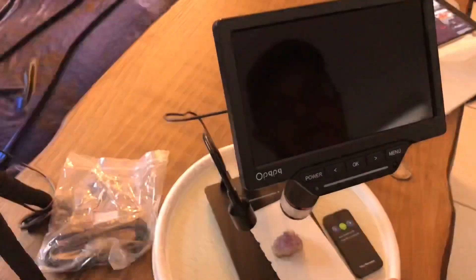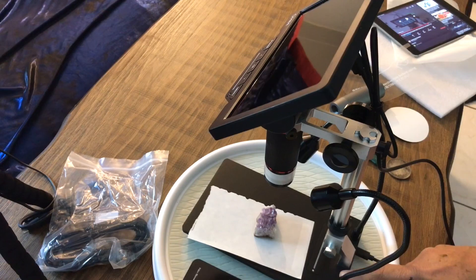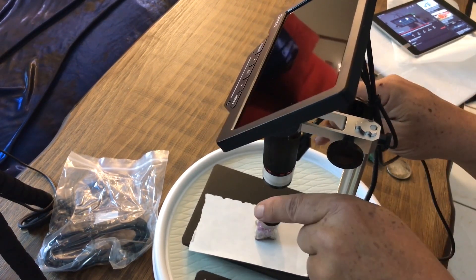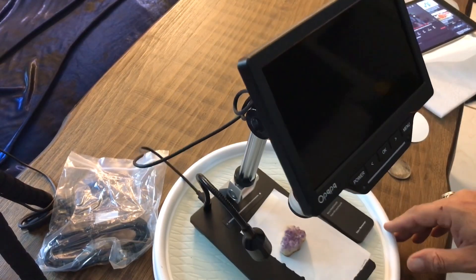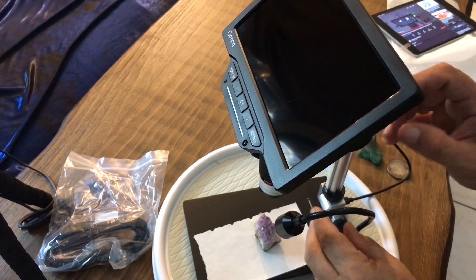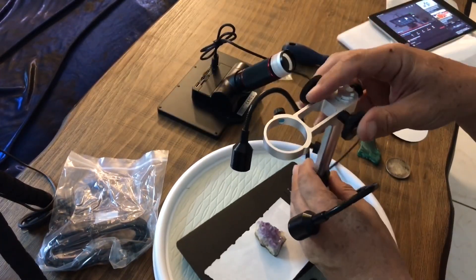One interesting thing: they say to hook up the cable the other way — USB to USB, the small one to the regular. I've hooked it up the other way and it seems to be working fine, so maybe it doesn't matter. They say there's a recommended way and there may be a reason for that, so you should probably follow the instructions. I threw this thing together pretty quickly and didn't really look at the instructions. So far, really impressed. And I was right — this is a riser, and it was included in the manual.